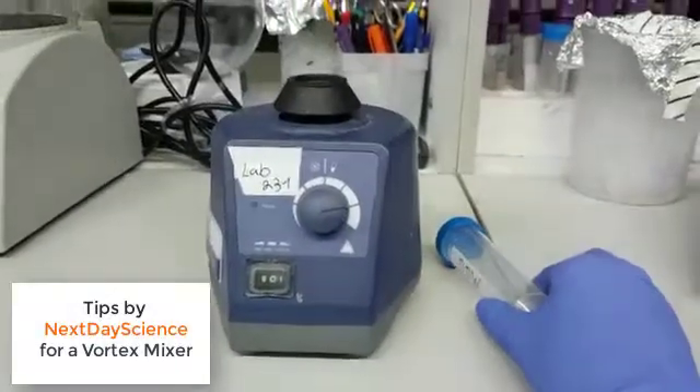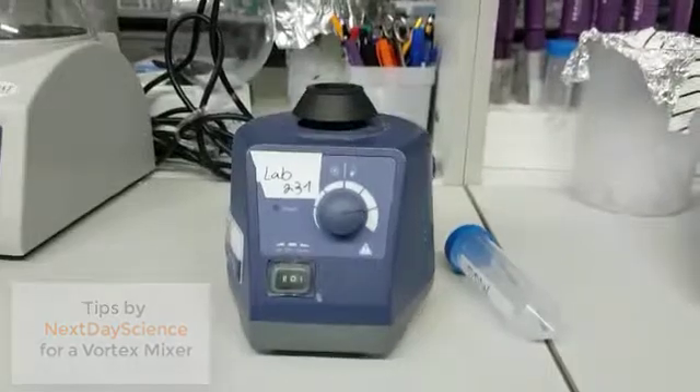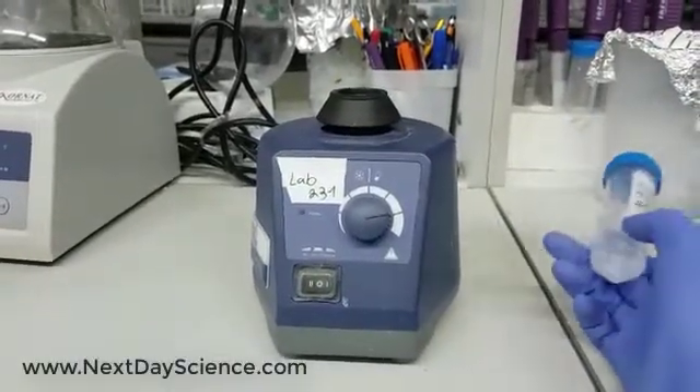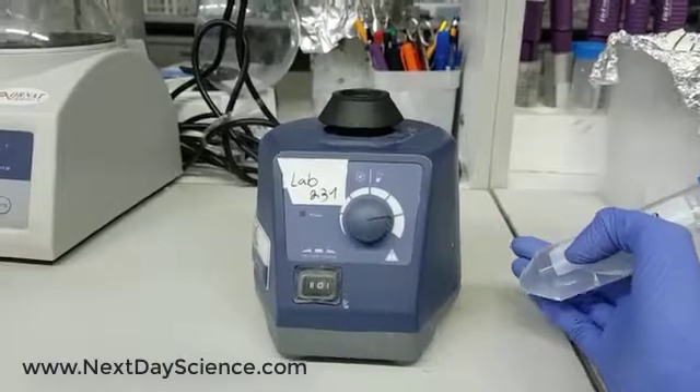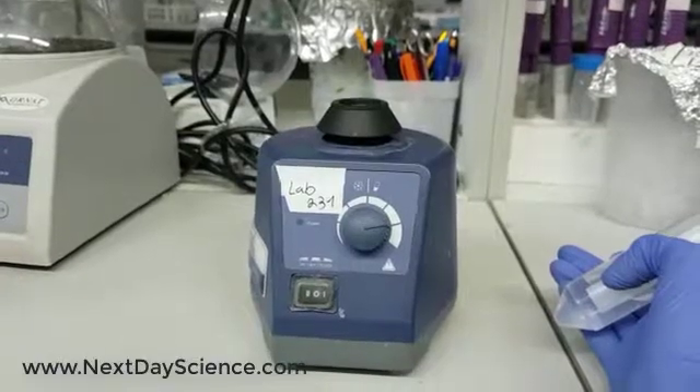Hi everyone, this is the Bench Mixer Vortex Mixer. It is used for making our sample homogenic by vortexing. For example, if you centrifuge your sample and you want to suspend your pellet with PBS, you can do it easily without making an effort by using a Vortex Mixer.